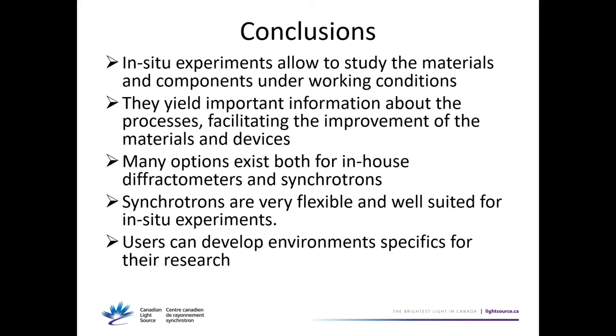Yes. I have a question about applying for beam time to do an in-situ experiment which hasn't been done before. So I want to do an in-situ experiment with a specific setup, let's say mechanical testing, something which hasn't been done before, like a biaxial rig. When I'm applying for the beam time, do I need to have the setup built before applying for it, or?